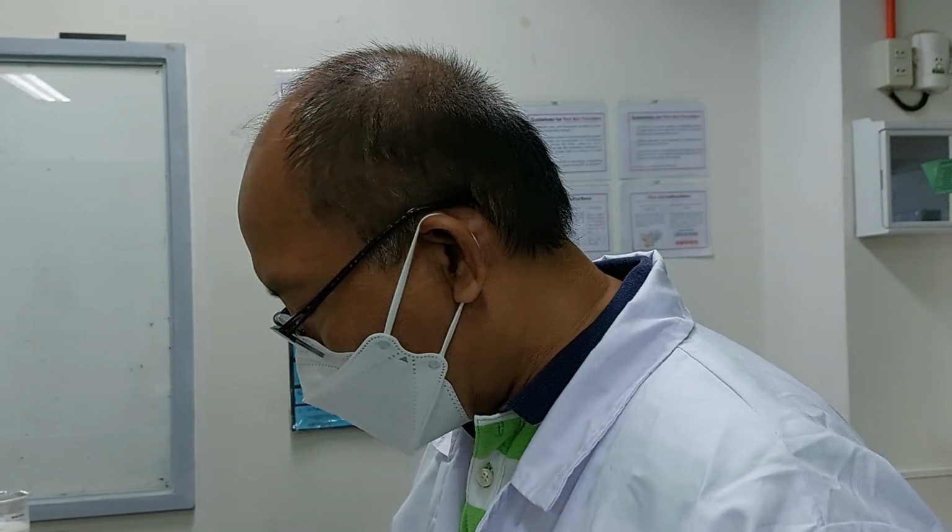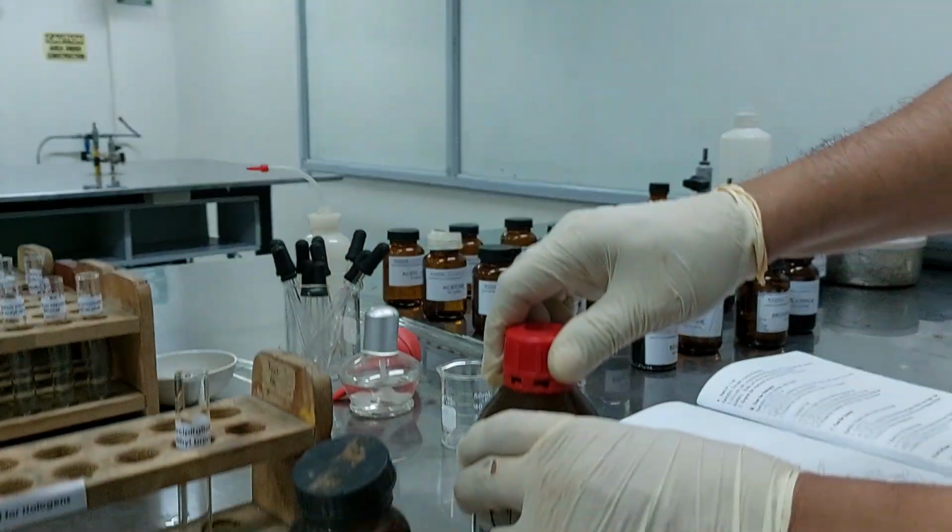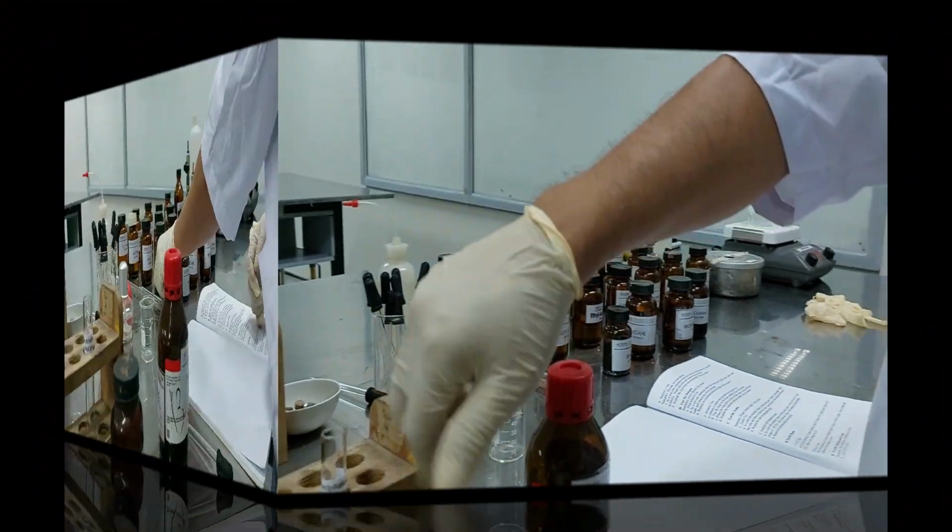So in our experiment, we are going to use ethyl bromide and observe the change in the color of bromine. It could have been better if you have ethyl chloride. So let's observe the change in color of bromine by flame test.